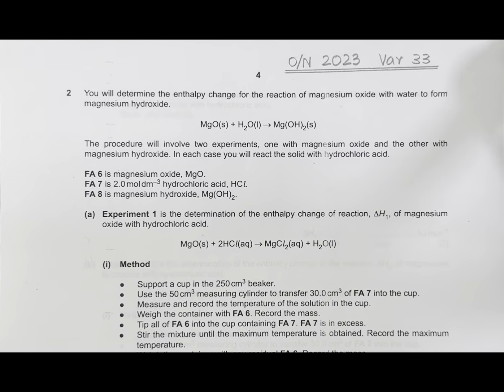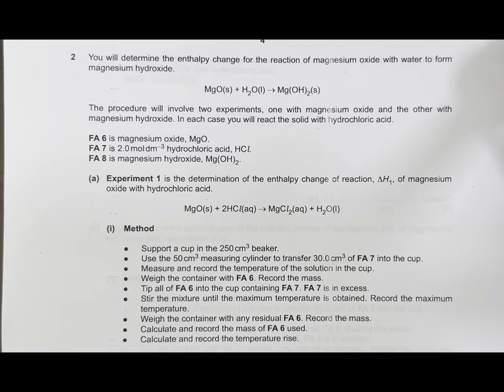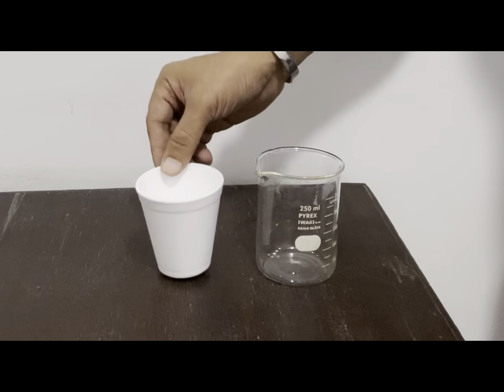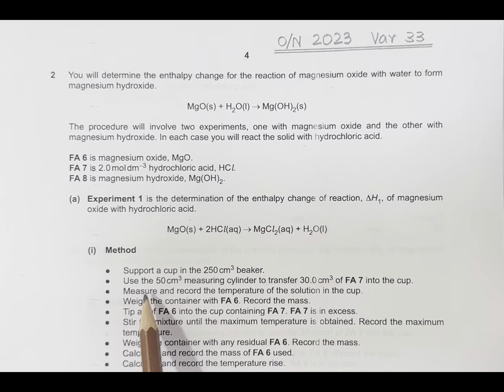The method says support a plastic cup in a 250 cm³ beaker. Use a 50 cm³ measuring cylinder to transfer 30 cm³ of FA7 into the plastic cup.